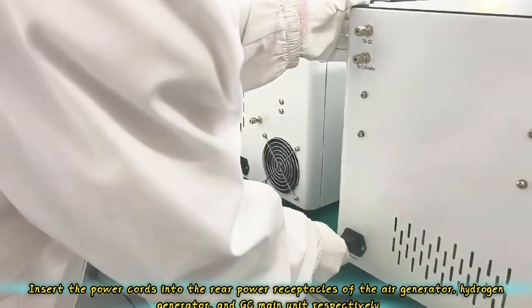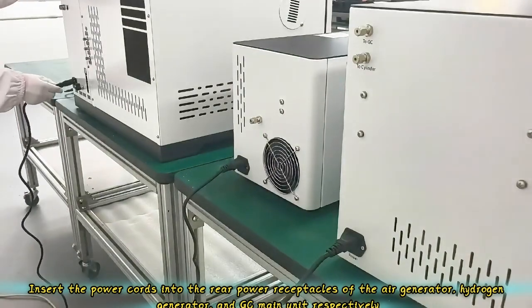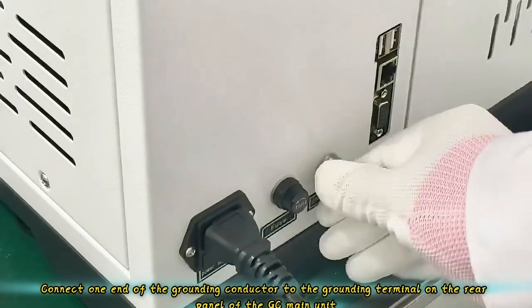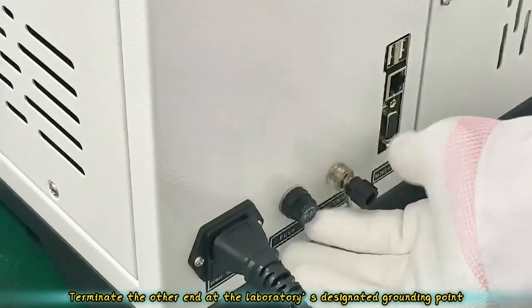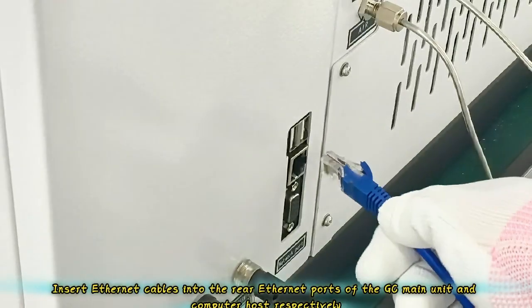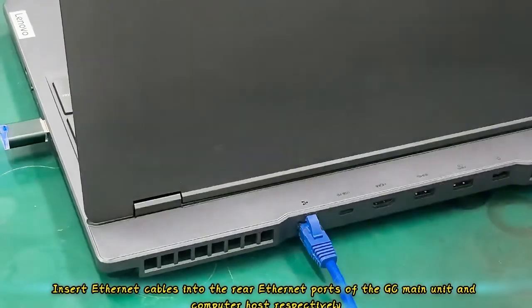Insert the power cords into the rear power receptacles of the air generator, hydrogen generator, and GC main unit respectively. Connect one end of the grounding conductor to the grounding terminal on the rear panel of the GC main unit. Terminate the other end at the laboratory's designated grounding point. Insert Ethernet cables into the rear Ethernet ports of the GC main unit and computer hosts respectively.